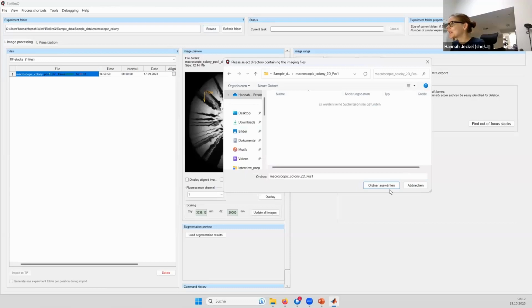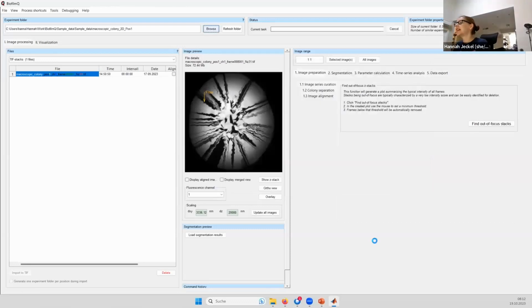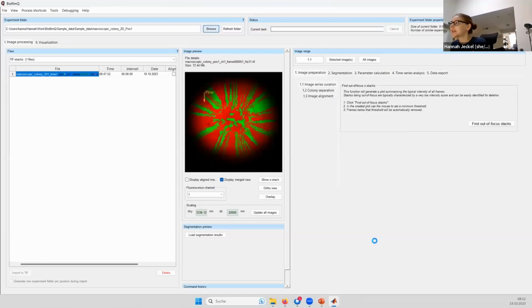And that means we can do things live, and I don't have to say, oh, I prepared something here, I prepared something there, but you can actually see it happen, which I think is a little bit nicer. So we're going to look at this particular image today for the majority of the tutorial. What this shows here is that we have a mixture of two strains that fluoresce in different colors, inoculated on an agar plate, and then grown over a span of time.